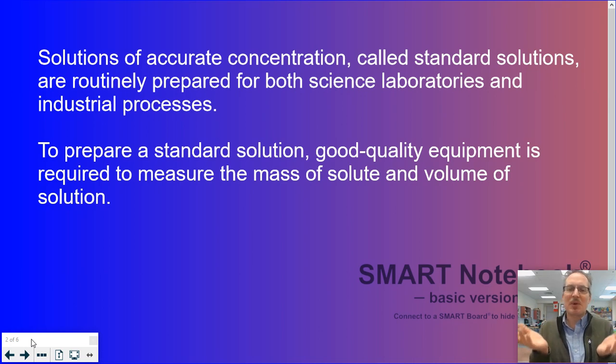It can fluctuate between 5 to 10 mils in that 100 mil range there because it's something called a meniscus. The wider it is, the less accurate it is. So every time we grab a piece of accurate glassware, you're going to notice that it's very, very skinny.